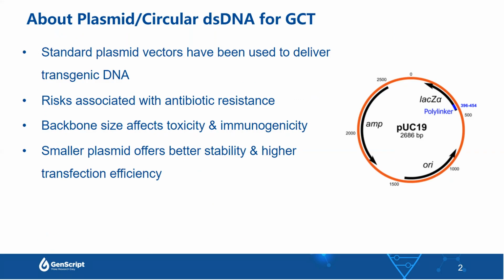Plasmid has been commonly used as a vector system to provide genetic information in non-viral gene and cell therapy or DNA vaccine. Although much safer than viral approaches, plasmid vectors generally do encode antibiotic-resistant genes in backbone. These antibiotic-resistant gene markers, as well as the bacterial region, constitute a possible safety risk, and they are associated with structural plasmid instabilities and decrease gene delivery efficiency.